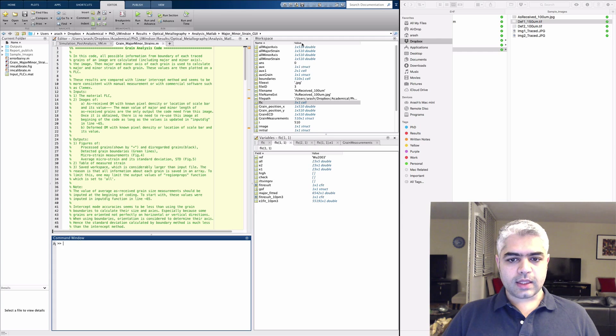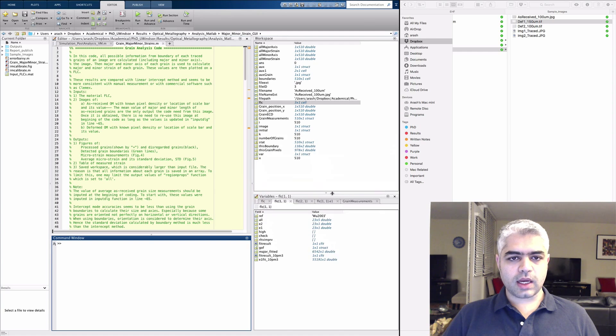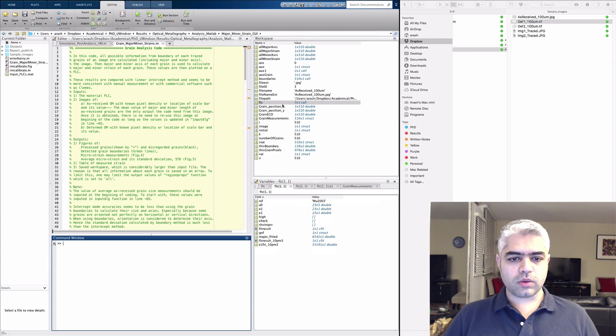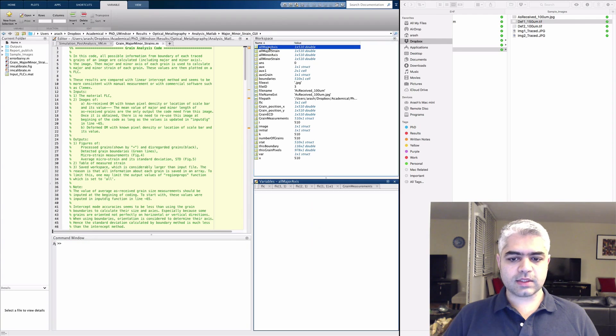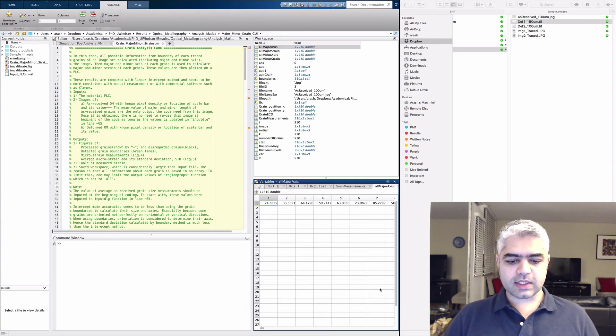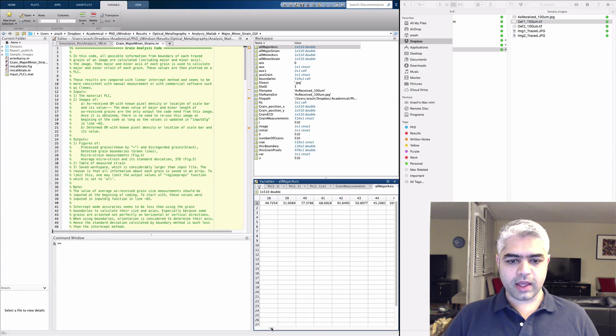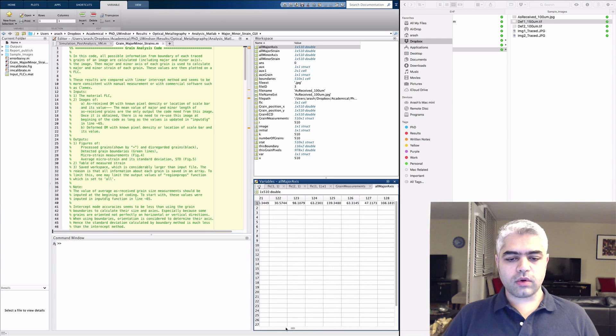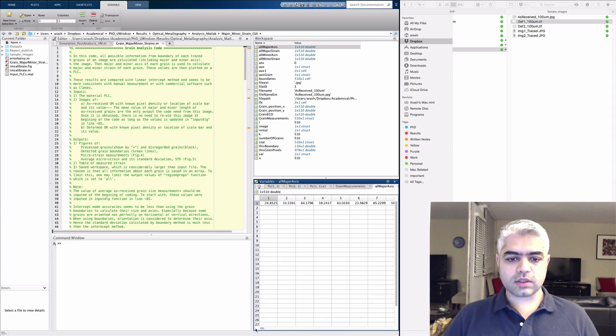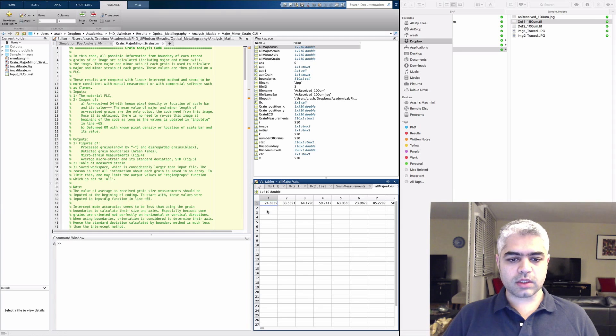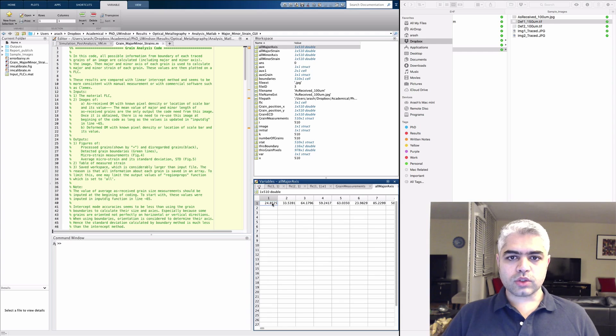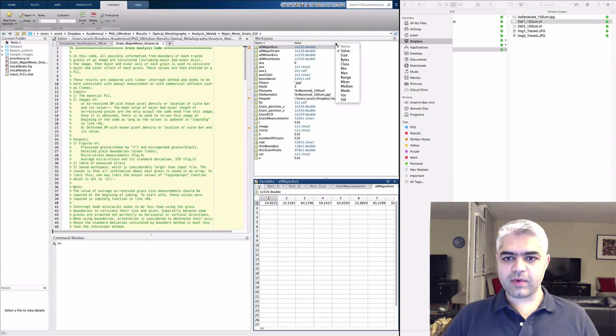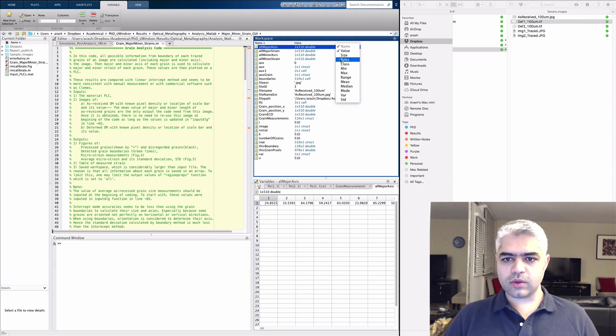If you click on your all major x axis, you can see that it is an array full of numbers. These are the grain numbers—one is the grain number one, and this is the major axis of it. So you can have the mean value or the average value here.